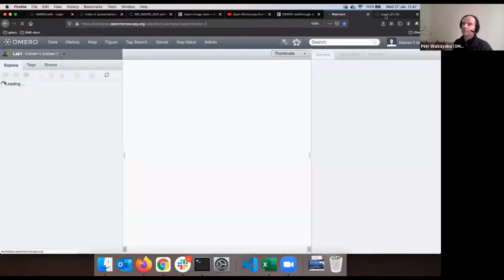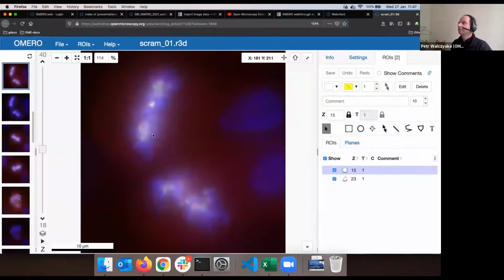Okay. So now I'm going back to my own portfolio, and this will happen in a second. And I'm coming back to this new tab which I opened, and I will show you how to draw regions of interest in iViewer. Sorry for the sidekick.